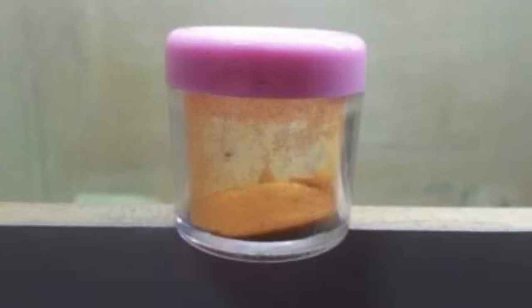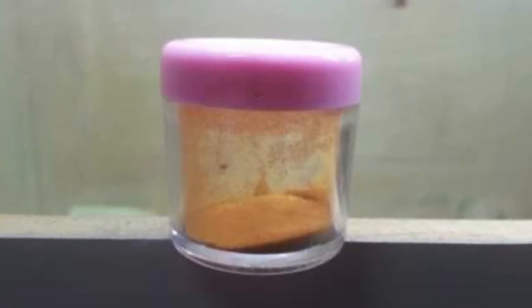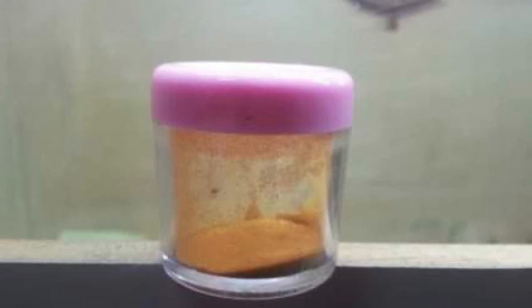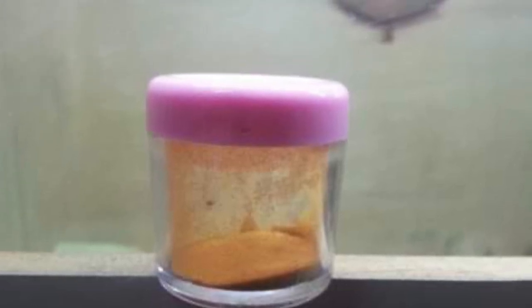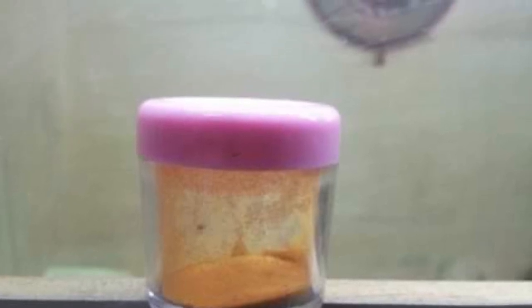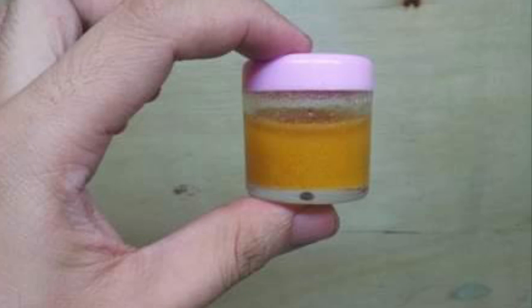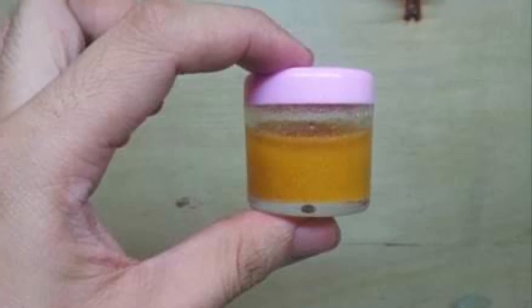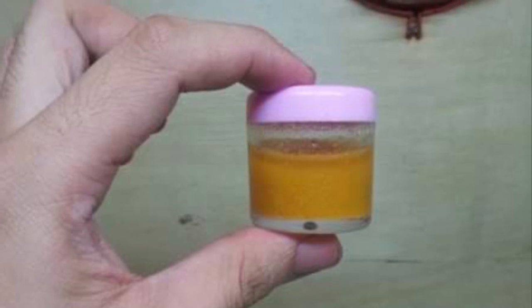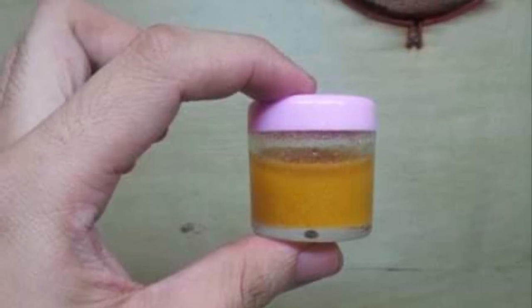Seeds may be stored in small canisters. Addition of a small amount of silica gel helps keep the seeds dry and prevents molds and bacterial infection. For sterilization, a five-fold volume of 2% Clorox or 5% hydrogen peroxide (10 volume) is added to the seeds and shaken briskly.